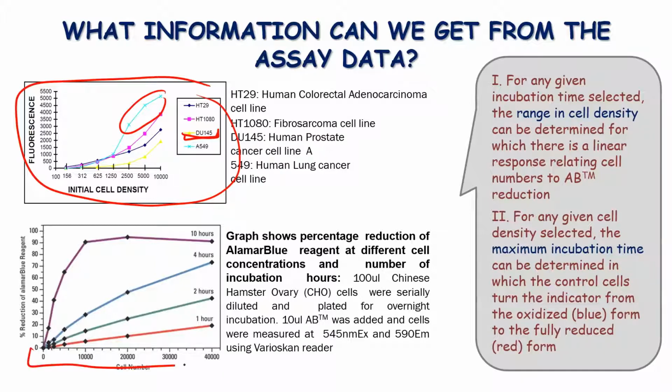So here you are seeing the plot that shows you the rates of division. If you look at the first hour, let's say, and see one of the points here, you drop it on the y-axis and see how others behave, and at what cell density they actually hit the same value of the y-axis.